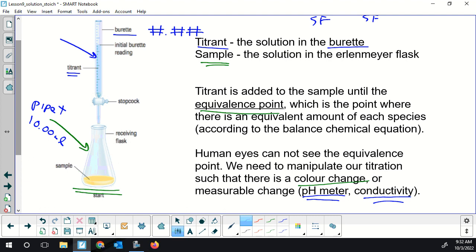Now, same with the burettes. You're going to rinse a pipette with your solution. So you're not going to try to just fill these with water and dry them somehow, blow air through them. Okay? If you want acid in here, you're going to suck up some acid into your pipette. You're going to rinse the little fat bulb in the middle and just let it drain into whatever waste you're told to use that lab. Then any droplets inside would be the chemical you want, and then you can fill it up.